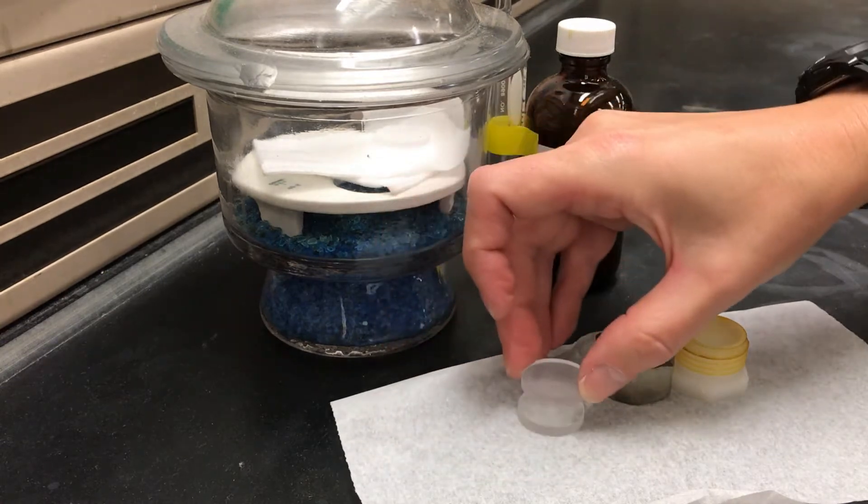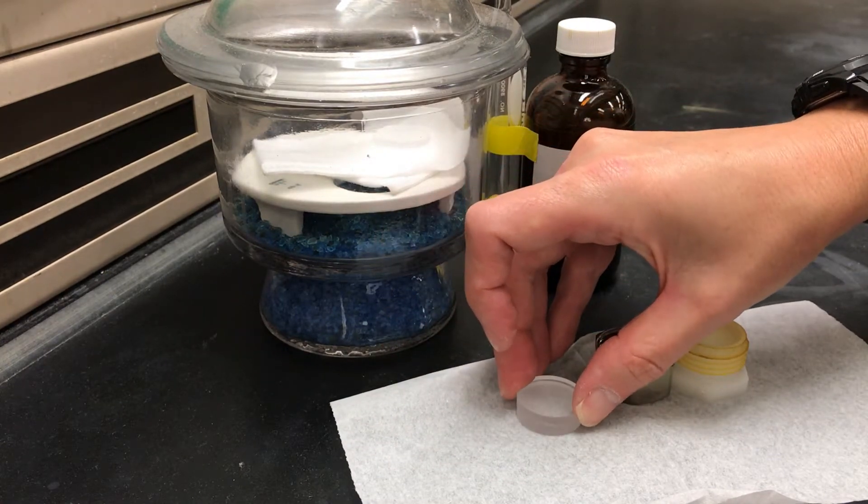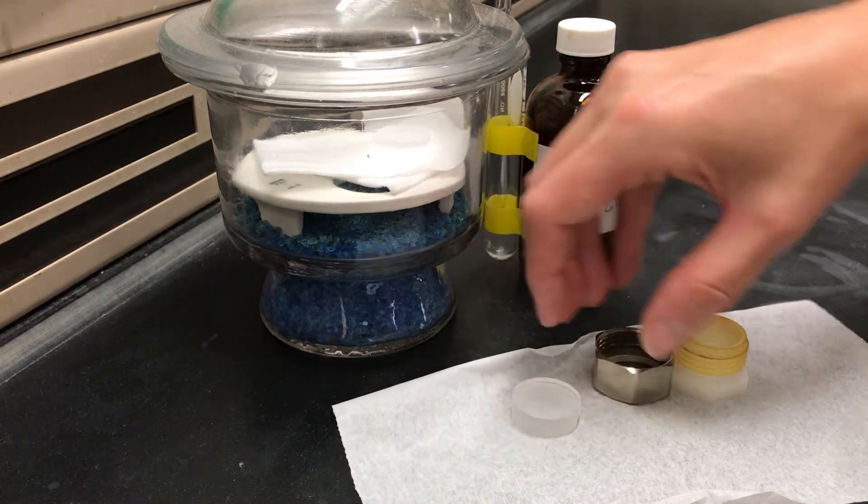Then you take the second plate and you put that over top of the first and so that spreads the sample out into a thin layer.